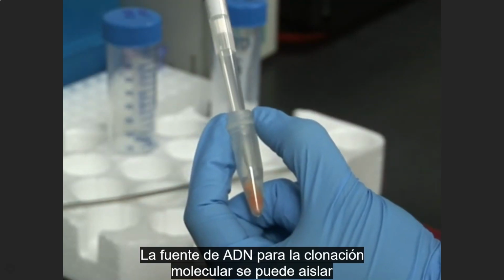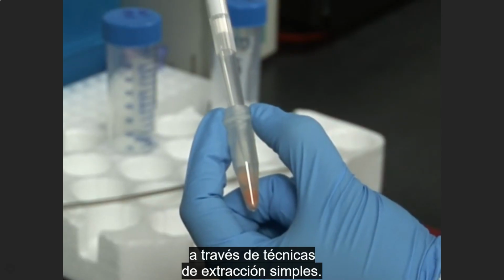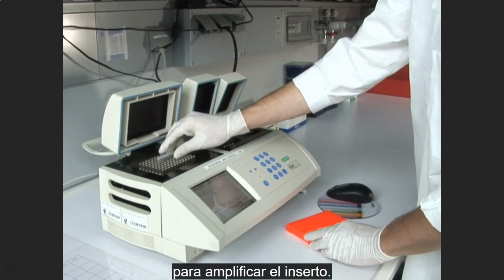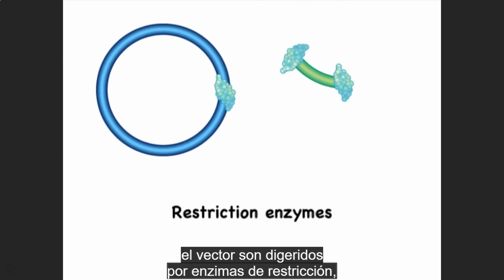The source of DNA for molecular cloning can be isolated from almost any type of cell or tissue sample through simple extraction techniques. Once isolated, PCR can be used to amplify the insert. Once the insert is amplified, both it and the vector are digested by restriction enzymes.